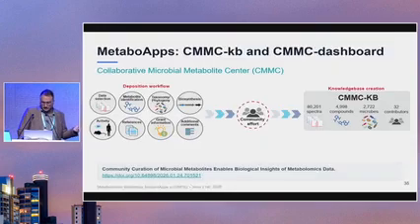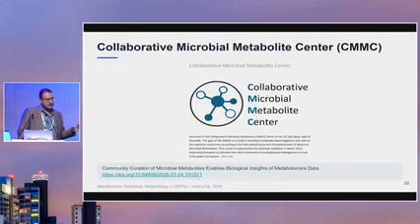So the third one is the CMMC dashboard. But before talking about the dashboard, the tool itself, I just want to talk a little bit on what is the CMMC, which is the Collaborative Microbial Metabolite Center, which is part of UC San Diego and UC Riverside, from Professor Pieter Dorrestein and Professor Daniel Petras. And the goal of the CMMC, for the ones that are not familiar with it, is to build a microbial metabolite knowledge base.